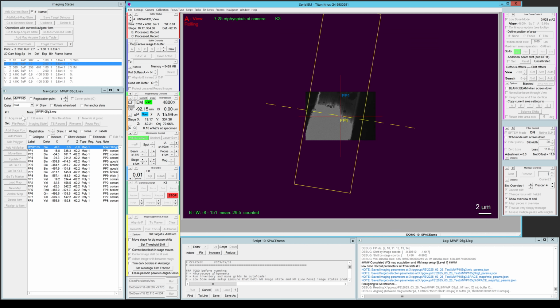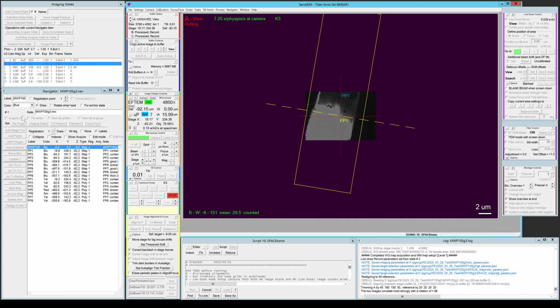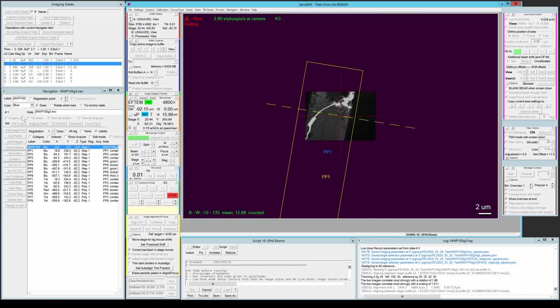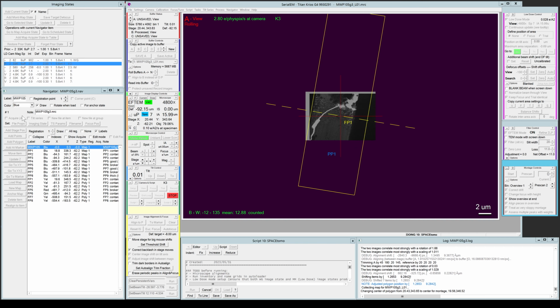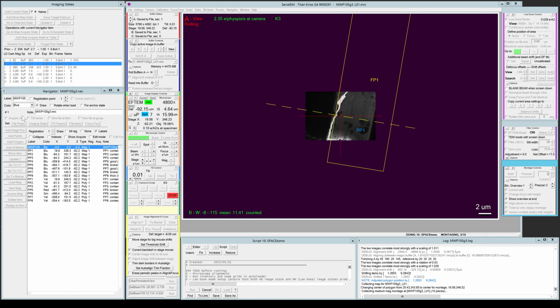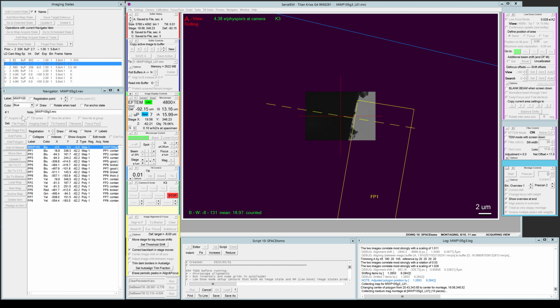Next up is one more mag jump to the view magnification of your low-dose state, which in my case is 4800. And again, it will first try to take a view image and use the align between mags routine to compare that to the intermediate mag image. In some cases it might fail, and as a fallback it will just use the stage coordinate it determined at the intermediate magnification. So it's still helpful to have the magnifications aligned, but with all these align between mags routines it should be fairly robust even if your mags are not perfectly aligned.